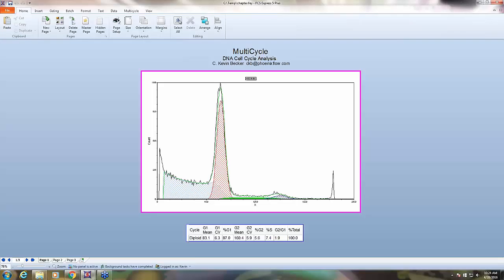Sean, do we have any idea of people? Are people novices at cell cycle, or do we have any idea who we're talking to here or not? I think we have a group of people that ranges from people who have never maybe done cell cycle at all to people who are doing it day to day. So I would probably gear this to the intermediate level of user, and assume we know nothing and everything at the same time. Okay, and does anybody have a specific question about cell cycle that we can try and address? Are you getting any feedback on that?